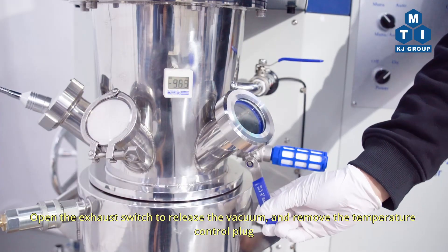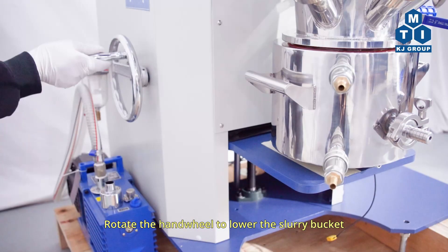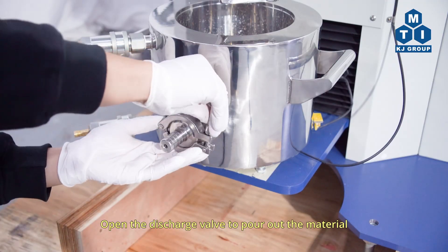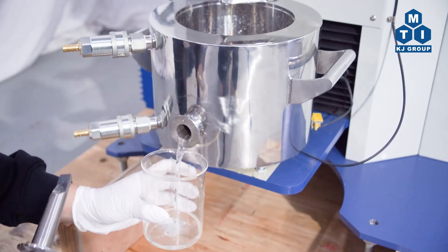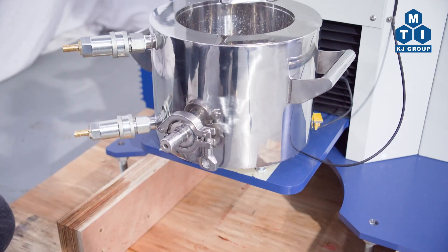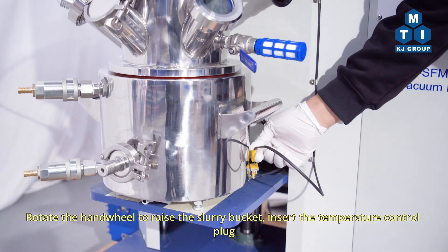Open the exhaust switch to release the vacuum and remove the temperature control plug. Rotate the handwheel to lower the slurry bucket. Open the discharge valve to pour out the material. Then rotate the handwheel to raise the slurry bucket and insert the temperature control plug.